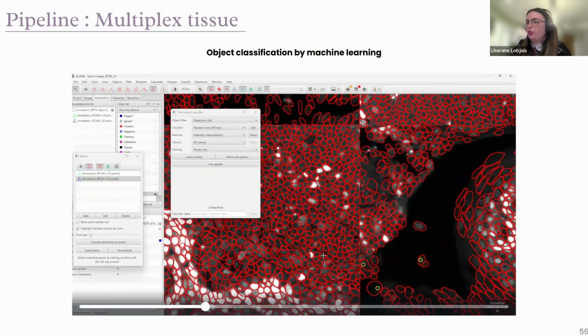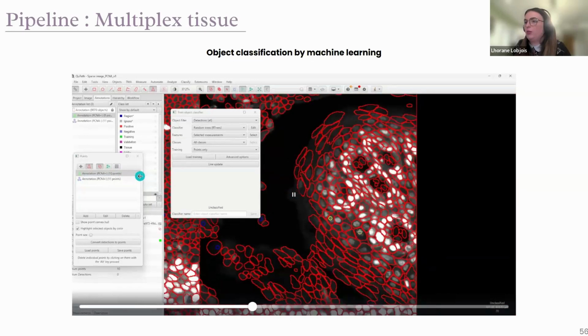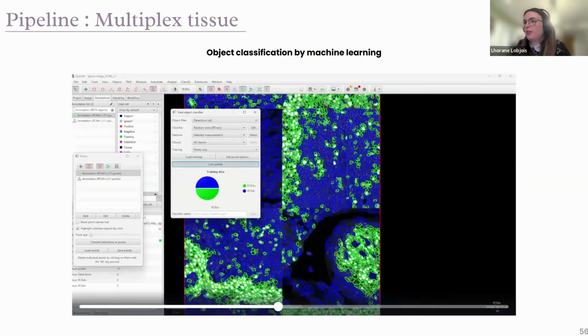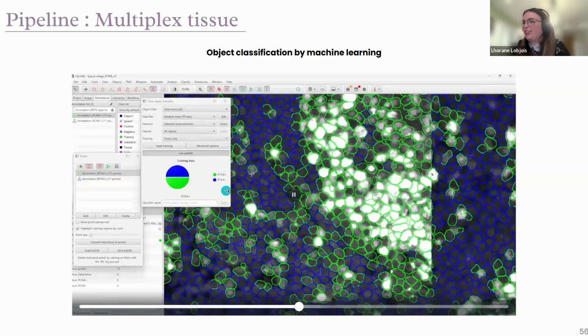It depends on the user. Most of the time I'm doing that with the researcher or the doctoral student. Then I switch to positive cells. The goal is to have a minimum of 6 or 7 points to start. It's the minimum to work. And when you have the same number, you can click on live and see it. So you see live what you prefer and what's done. So that's great. And you can adjust it.